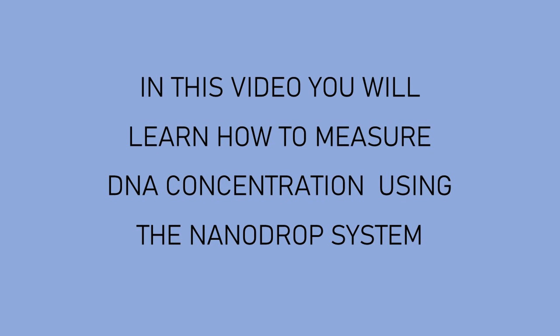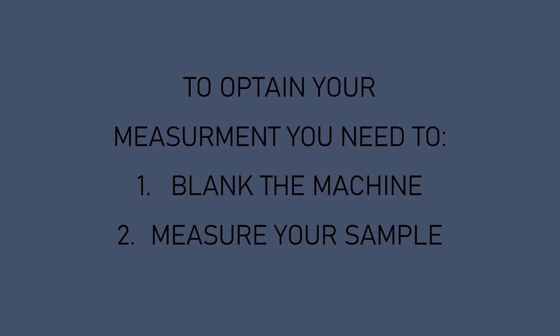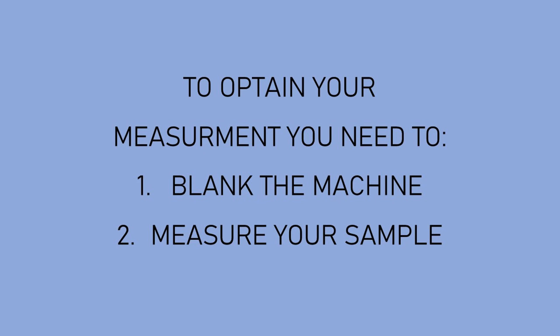Hey guys, in this video you will learn how to measure DNA concentration using the Nanotrop system. In order to operate this machine, you need to blank the machine and then you can measure your sample.